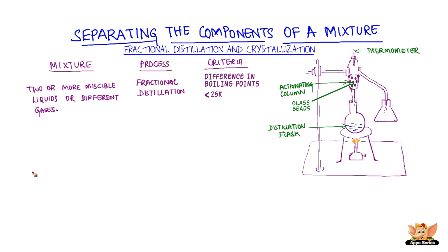The apparatus is similar to simple distillation, except that the distillation flask has a fractionating column — a tube packed with glass beads — fit with it as shown in the figure. The glass beads provide a surface for vapors to cool and condense repeatedly.